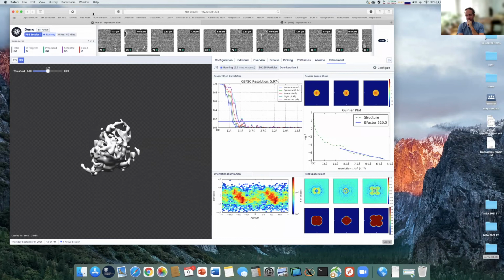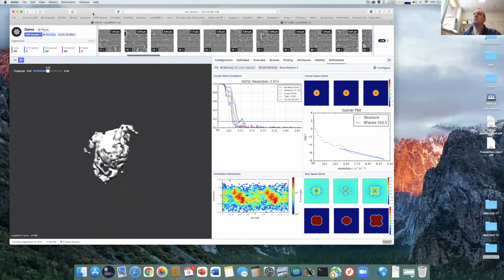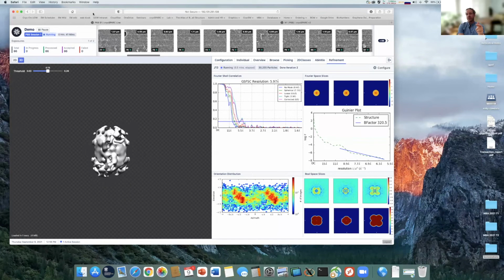In terms of cryoSPARC and their licensing, we did clarify with them how we ran the facility, and they weren't concerned at that point. This was during the beta period of cryoSPARC Live. So I'm not sure how things will change, especially for people coming in now trying to get a new license for cryoSPARC Live. We were quite involved during the beta period, going back and forth with cryoSPARC a lot in that development phase, working out the bugs and adding new features. So we work in that partner space.